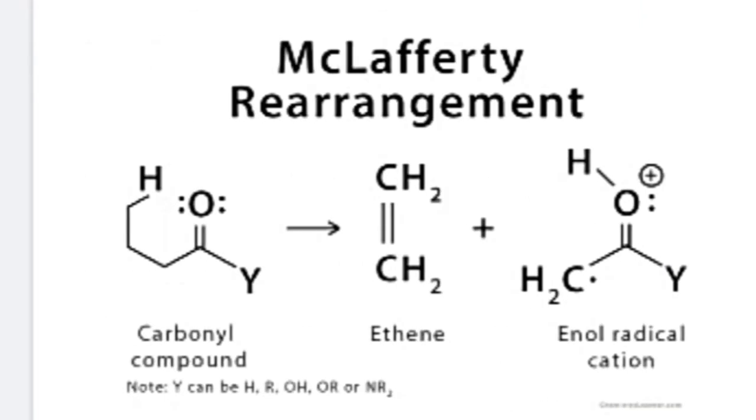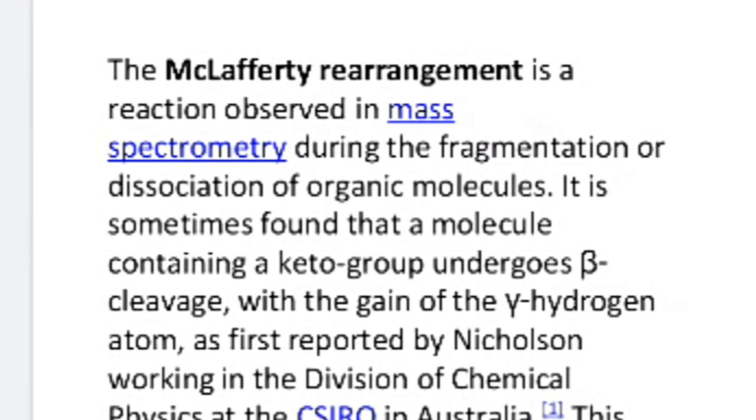So this beta cleavage with the gain of gamma hydrogen we call the McLafferty rearrangement.